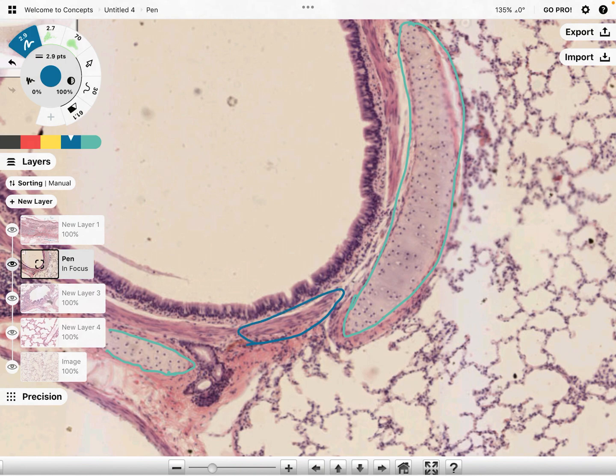We can also see there's smooth muscle in this area as well. Denote that as SM for smooth muscle, or SMU maybe. And then, of course, we're also seeing the pseudostratified ciliated columnar cells as well. So there's our epithelial layer. And some of these other layers that we talked about before, maybe a little bit too much into that area because actually getting a little bit into that smooth muscle, but that's the LP. That'll be our wonderful lamina propria there.